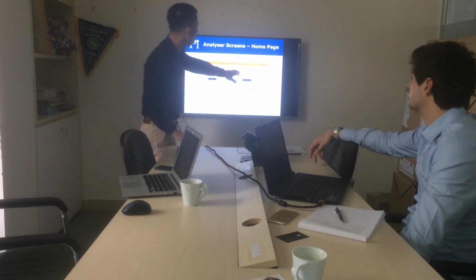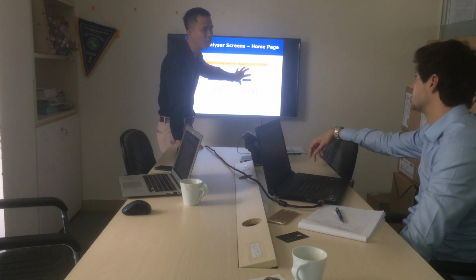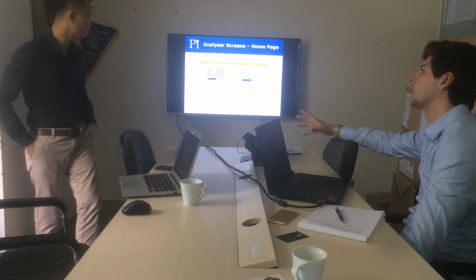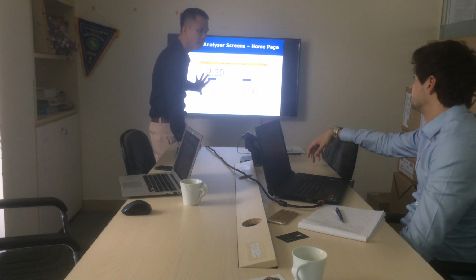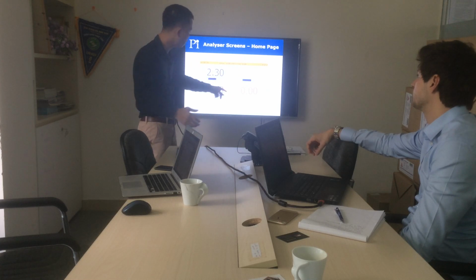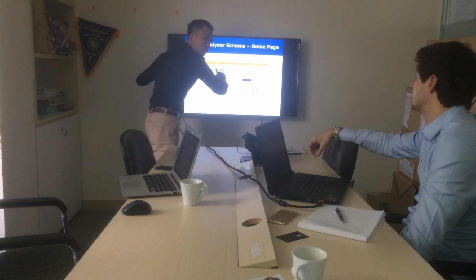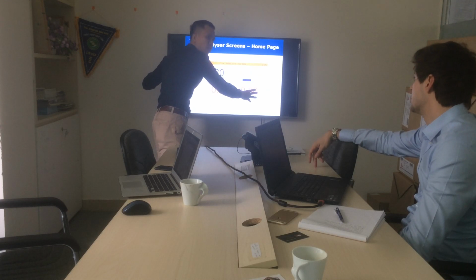So this state means calibration should be done. Either calibration needs to be done, or some kind of maintenance needs to be done. In case we do calibration, during the process it will output a type of signal to inform us of the different states: the normal, the calibration process, and the alarm on.